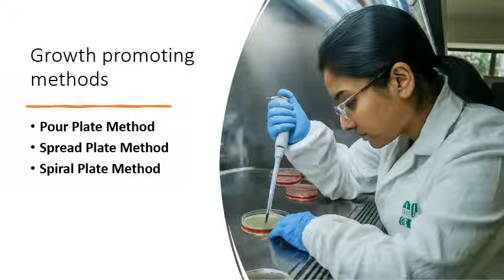Then ensure there are no bubbles. The agar is now inverted and incubated in the incubator for the specific required temperature and growth condition for the organism.